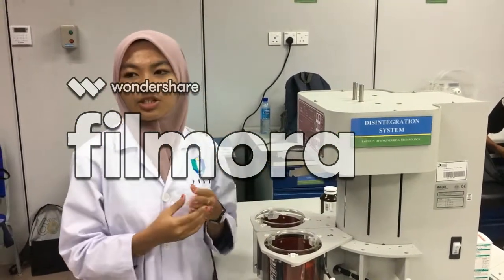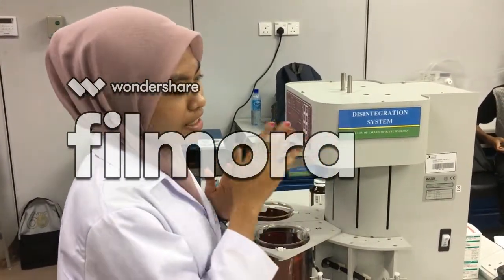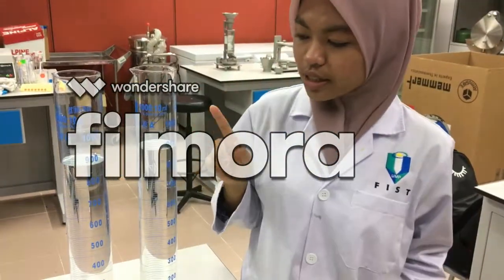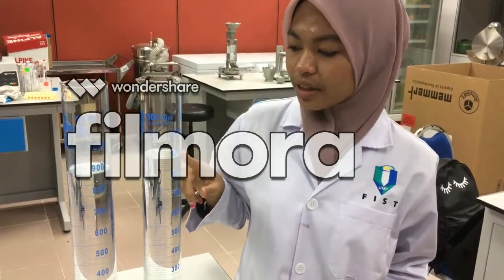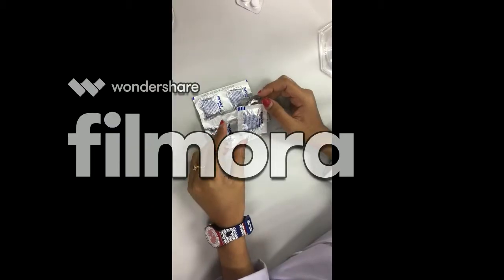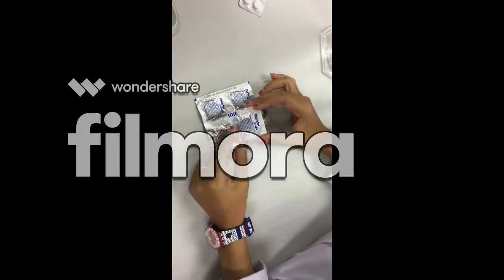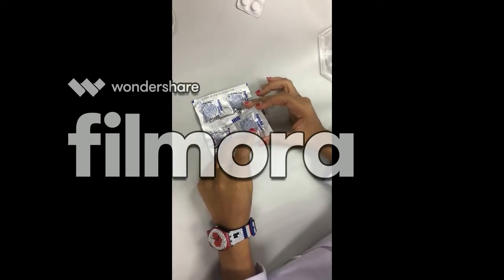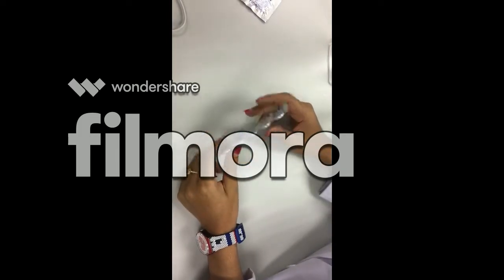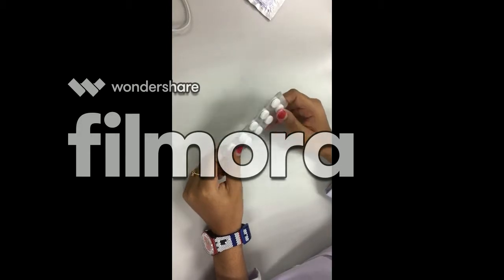The material that we use in this experiment is the disintegration system machine. Next, we use distilled water at 900 milliliters. The third material that we use is Panadol Soluble as effervescent tablet, and Panadol paracetamol as uncoated tablet.